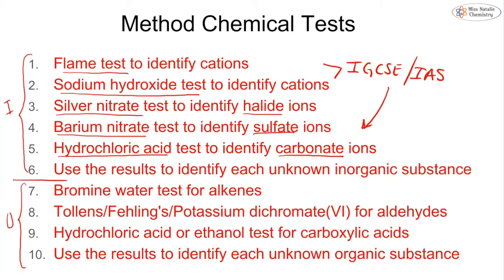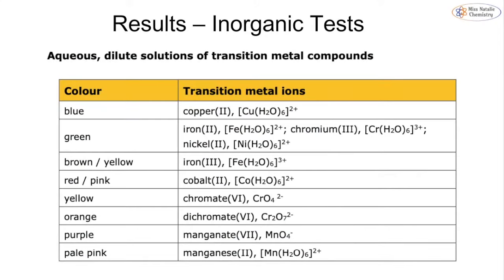So let's go through some of the results that we would expect to see. I'm not going to go through everything in great detail, because you can find all of this in the specification or in the practical guide. And that's the practical guide either found on the internet or via Edexcel's website.